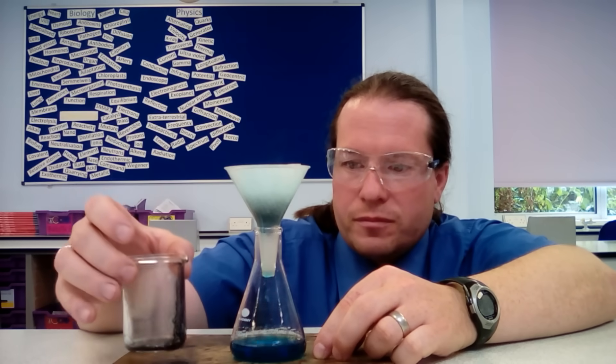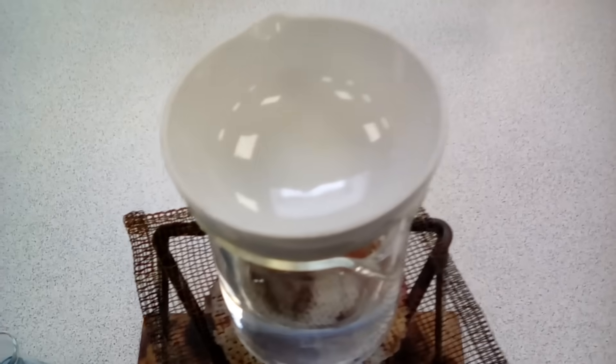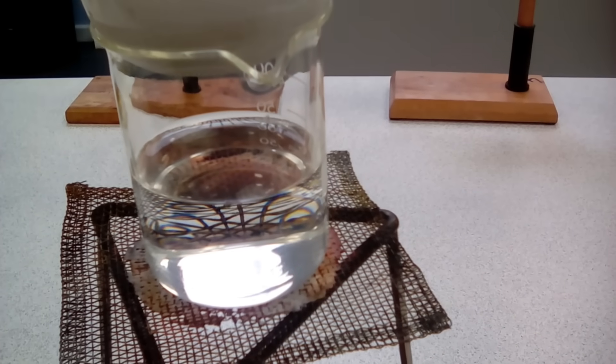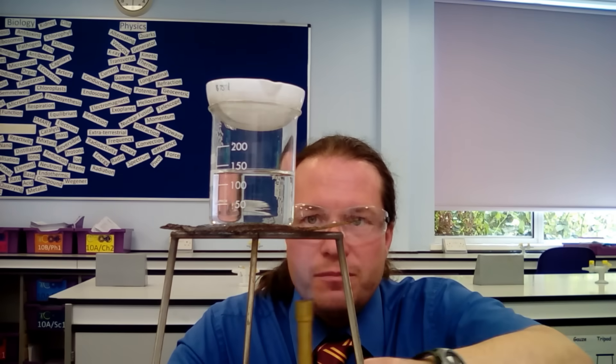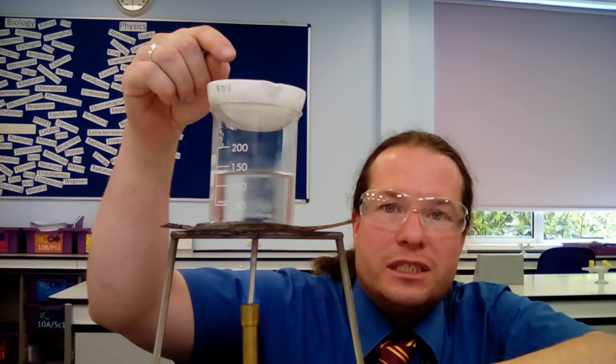Having filtered our copper sulfate solution, we transfer it to the evaporating dish, which is sitting on top of a beaker of water. For those of you that do cooking, this is like a bain-marie where you'd melt chocolate over a pan of hot water, and we heat that with our Bunsen burner. We open the air hole, get a roaring flame, and start to heat up the water bath, which will evaporate off the copper sulfate solution. The reason CLEAPSS advise against this method is that it's likely to spit if you overheat it — we don't want copper sulfate solution in anyone's eyes.